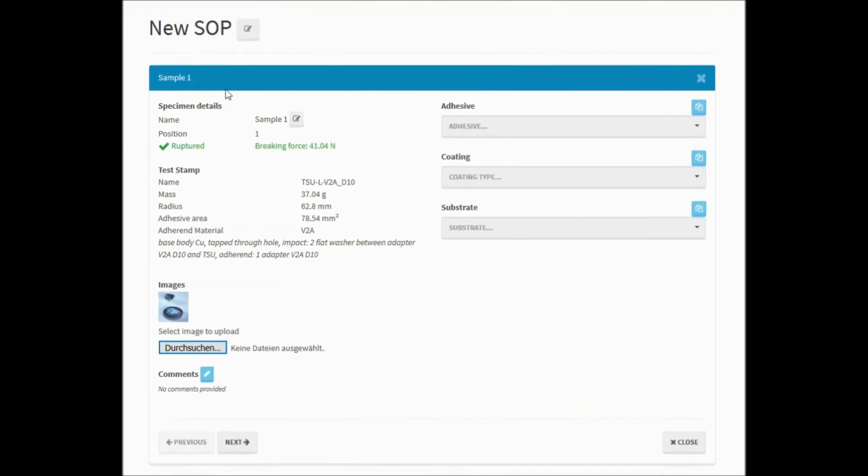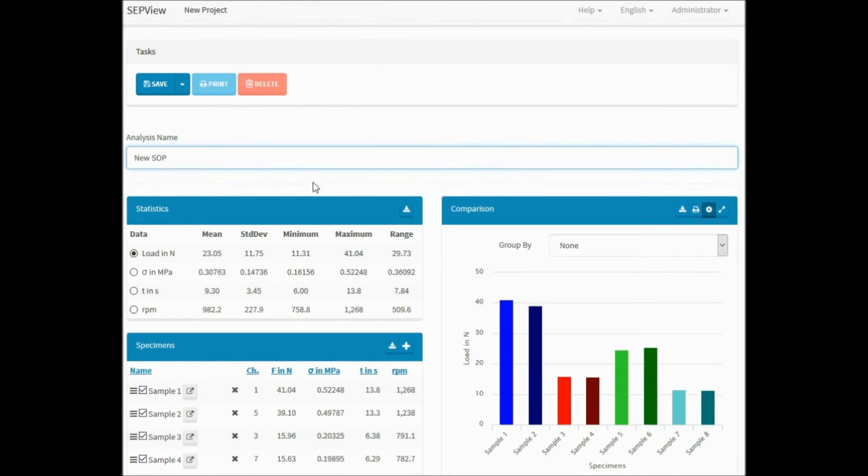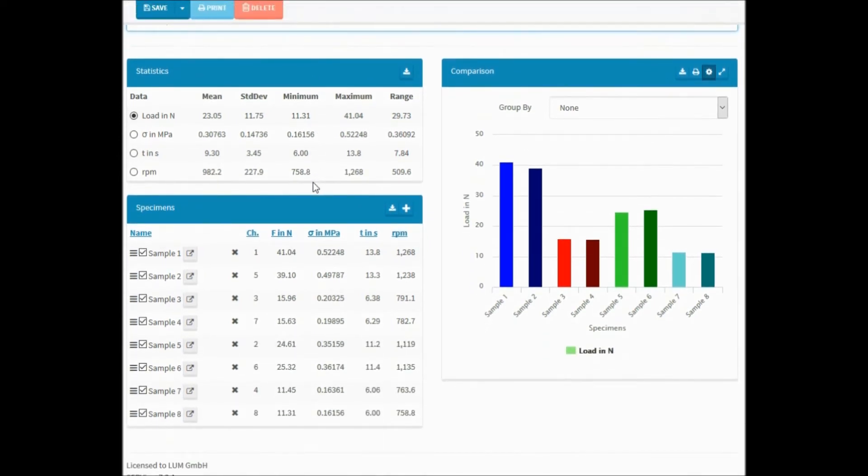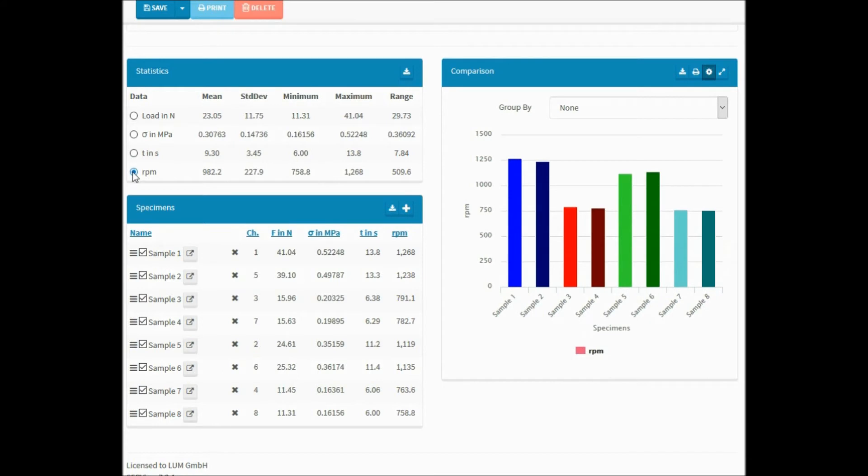By clicking the Analyze button, a new analysis window for the measurement is opened. The results for every specimen are shown numerically and in diagrams. The Statistics box allows choosing between breaking force, strength, measurement time or RPM as values for the graph shown in the Comparison box.